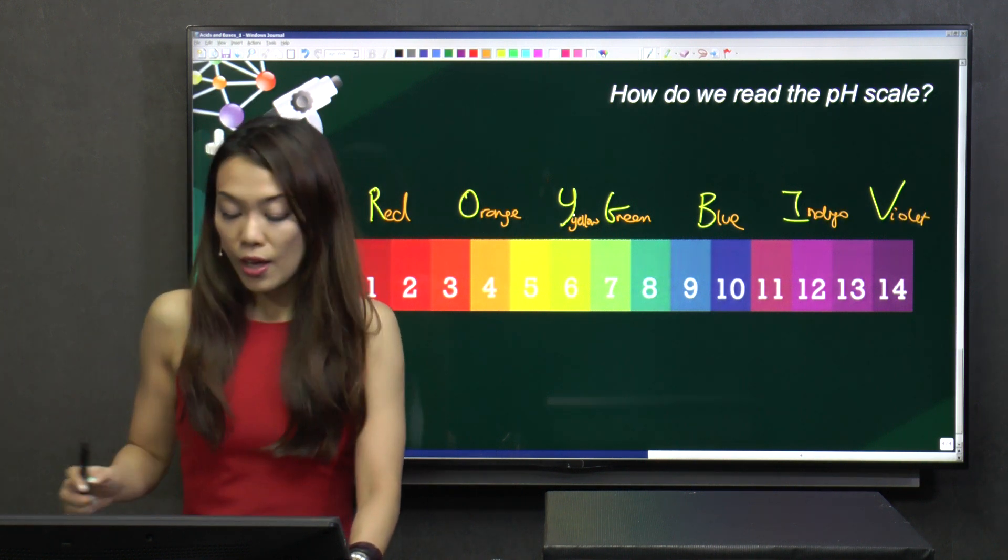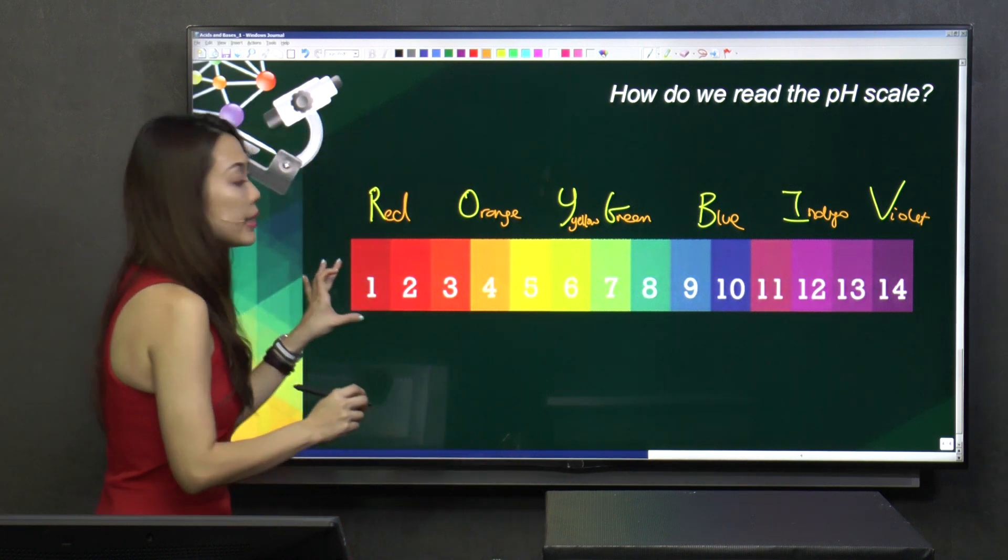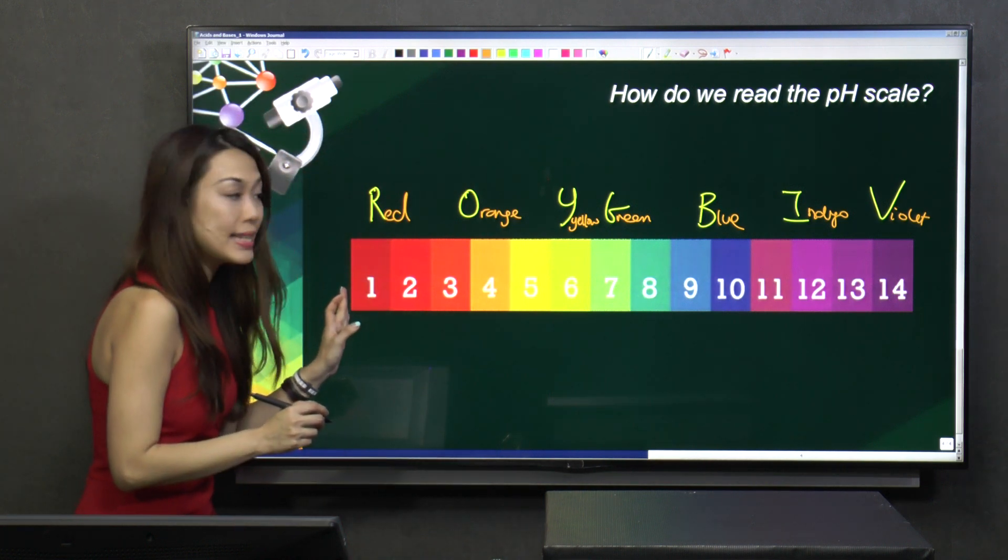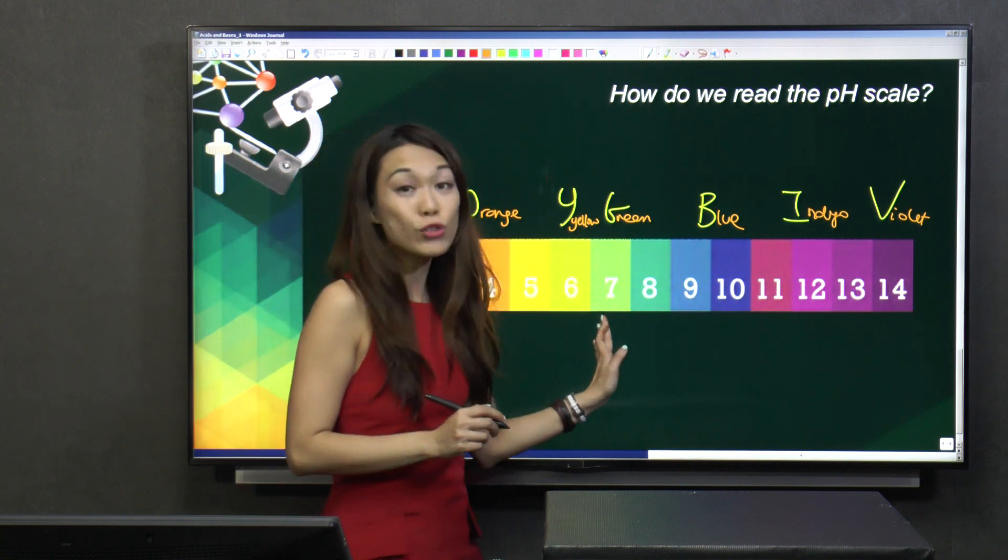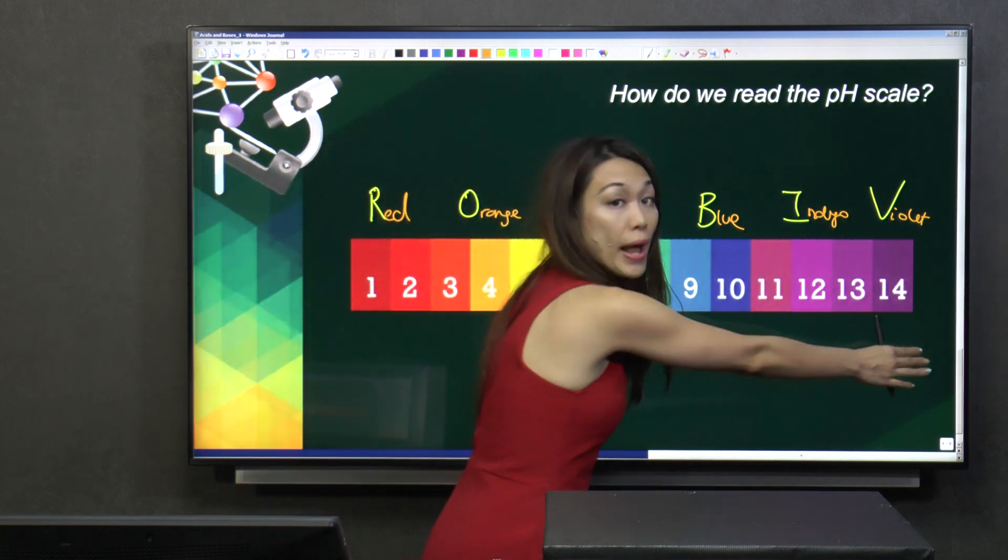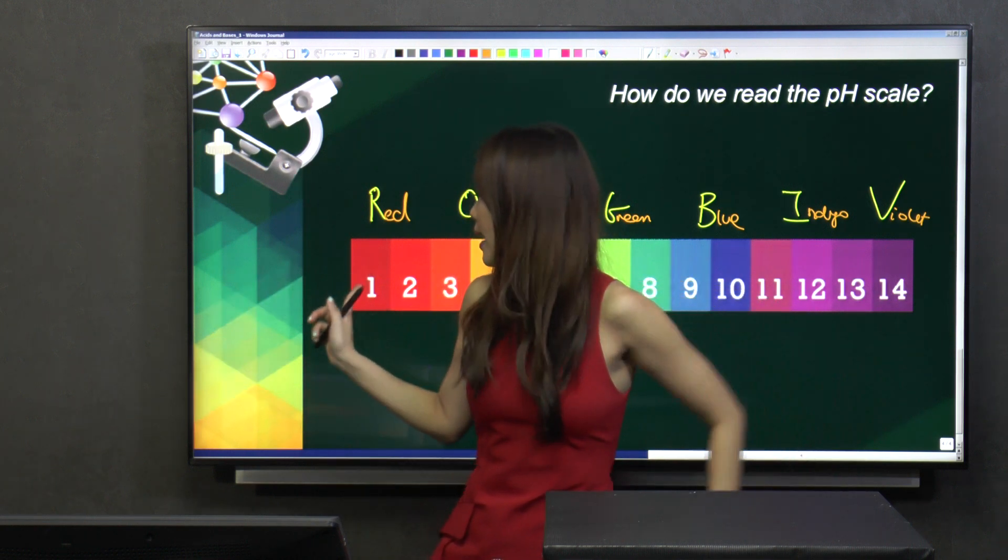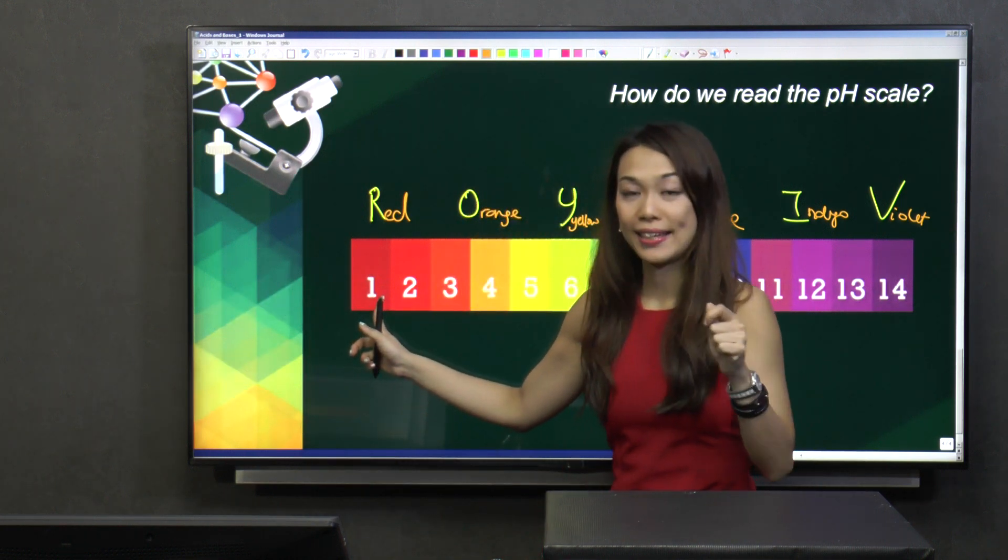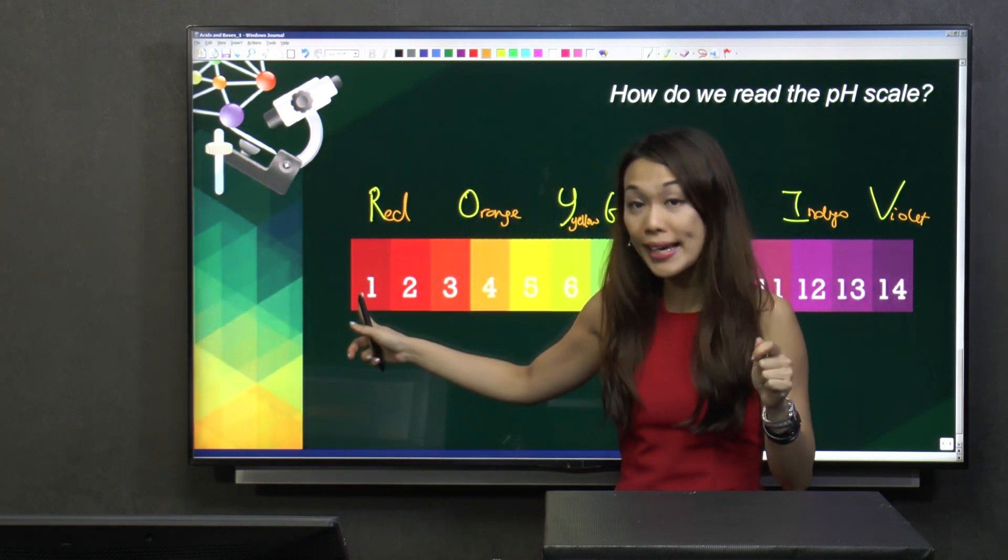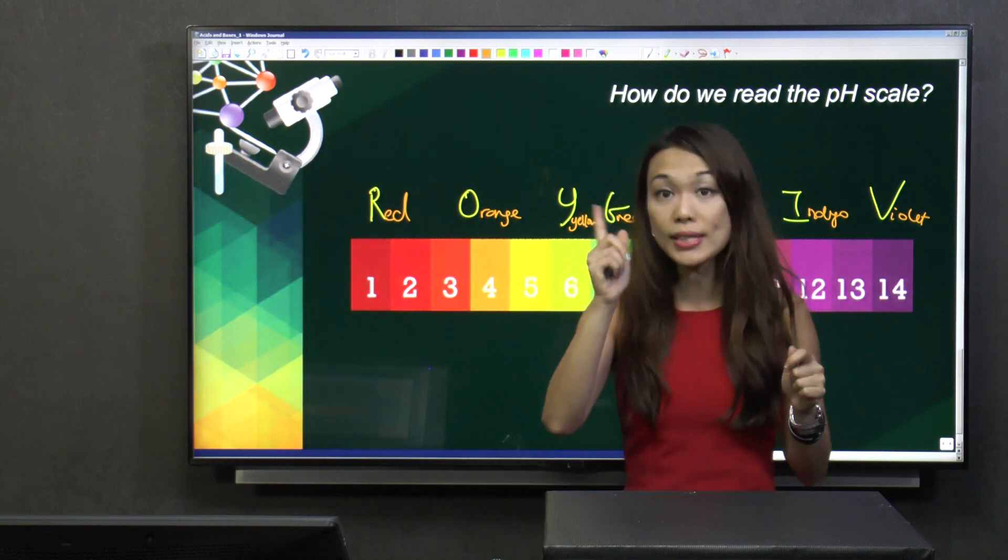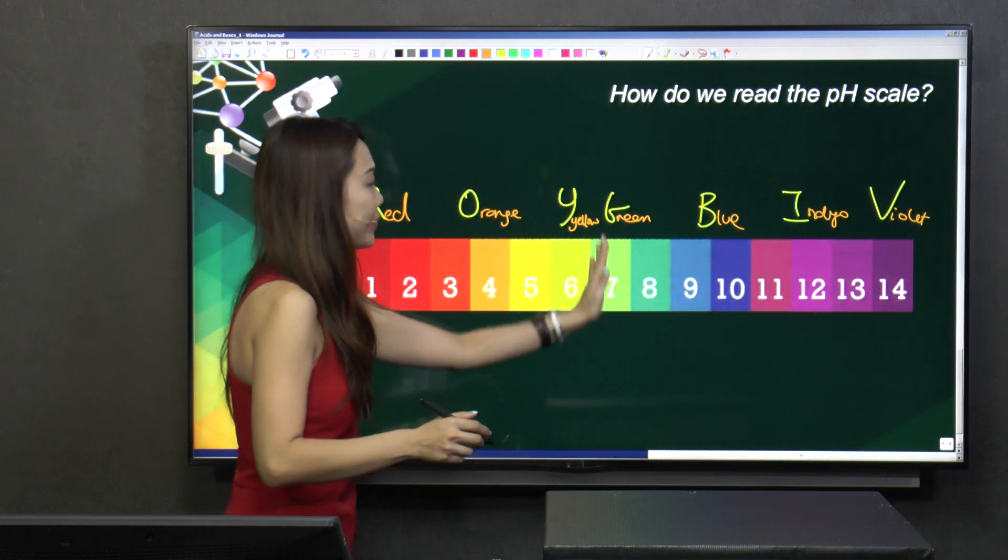Now, over here, the smaller the number, the more acidic it is. Seven will be neutral, and of course this range will be alkaline. And this is the most alkaline, this is the most acidic. So, number one here, pH1 is the most acidic, and of course neutral is green.